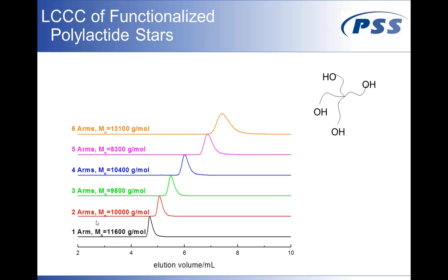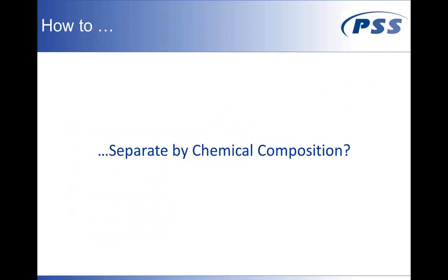It will terminate your polymerization reaction. This two-armed star, as I call it, will only give rise to a linear polycondensation, but it will not cross-link. And so you have to know what is the amount of material which actually can lead to cross-links. So indeed, the mode of separation for end group functionalization is critical chromatography.